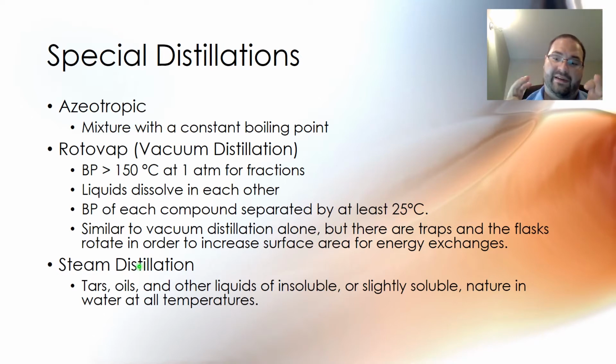And then you have, in addition to that flask, what they call Keck clips. They're little plastic clips that fit over the joints, and they make sure they don't fall off while something's spinning, or when you have it together in an apparatus. And some people actually use Keck clips in any apparatus that they're setting up, because a lot of the newer organic glassware sets have these in them, and so you just set them up automatically whether you're doing something rotational or not. Not all sets have that, though, but they're pretty easily purchasable. They're fairly cheap. They're plastic. It's not really that expensive.